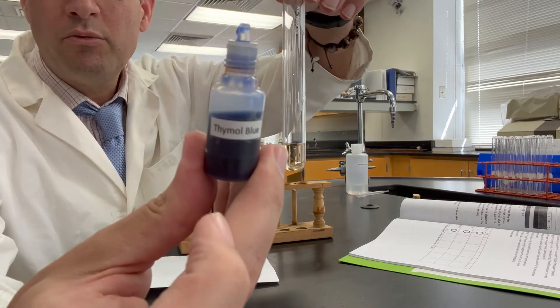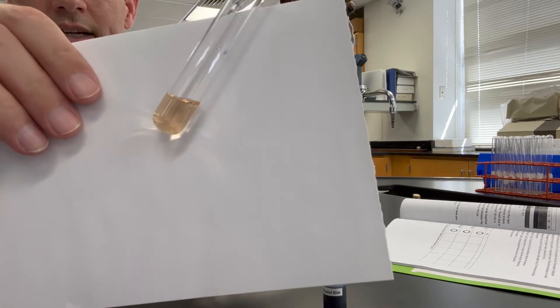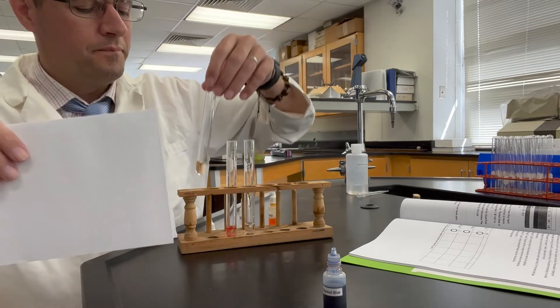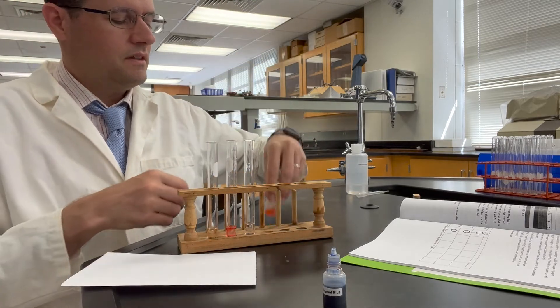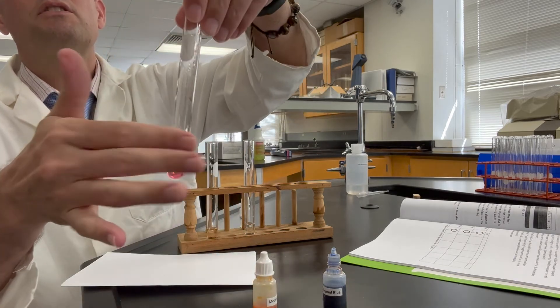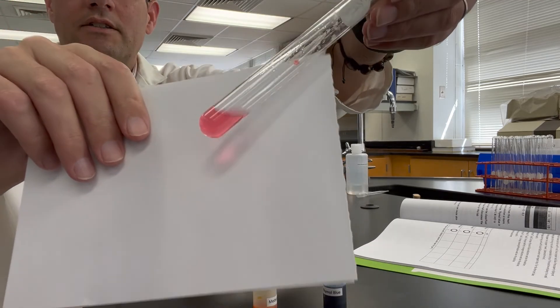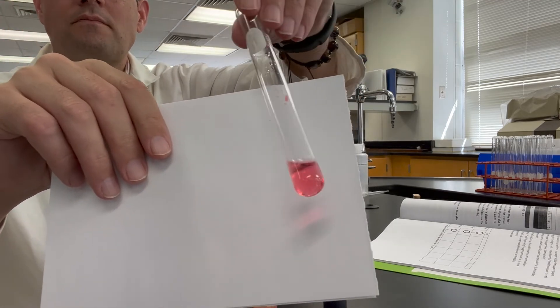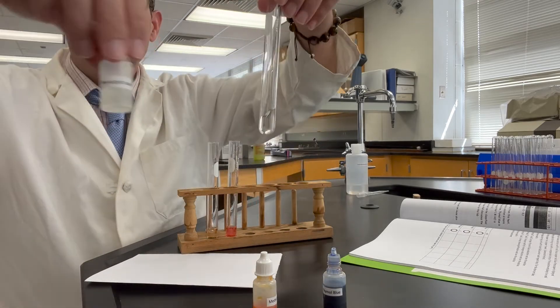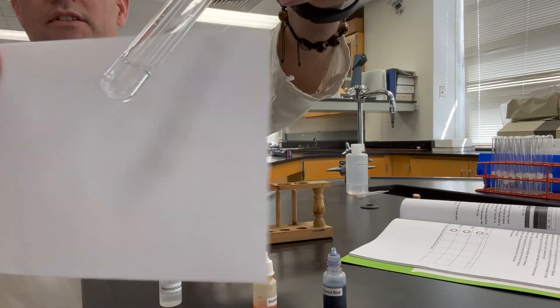This is thymol blue in 0.01 molar hydrochloric acid. The next one is methyl orange — methyl orange has this appearance in 0.01 molar hydrochloric acid. And the last one is phenolphthalein — phenolphthalein has this color in hydrochloric acid.